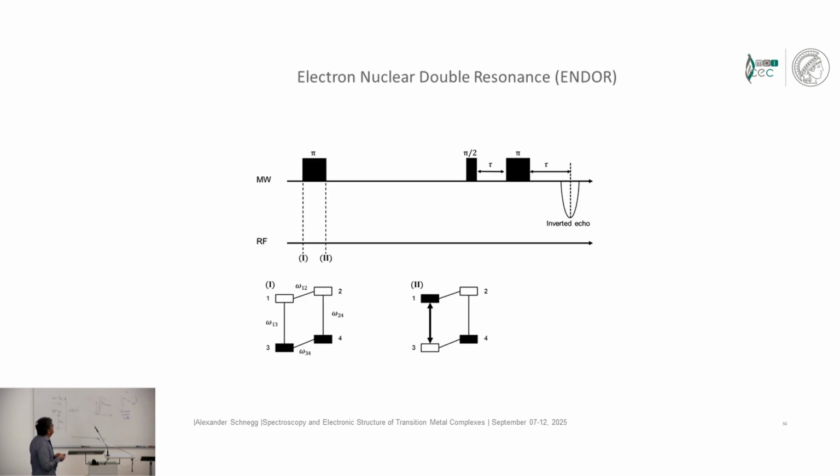If we now modify our pulse sequence, we have our echo sequence, and this is our 4-level scheme, and the echo inverts this polarization here. What we are doing now, this is preparation to get finally our double resonance, is that we apply a so-called pi pulse in the beginning. This pi pulse moves all the polarization here, and we can read this out with our echo sequence here. So this is the preparation pulse, we just wait a bit, and then we read this out.